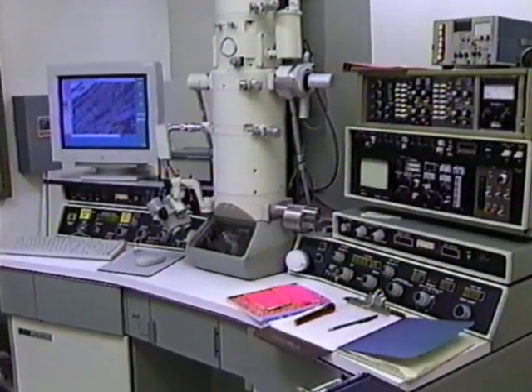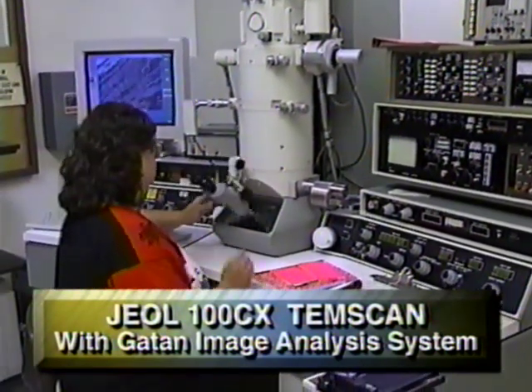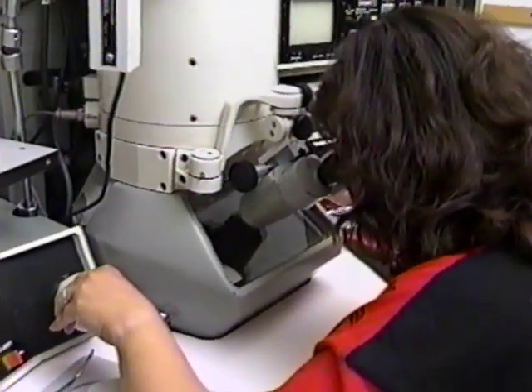Well, it's so impressive, the varied applications, like you say, looking at heart tissue, or looking at mustard, or looking at oil in a refinery. It's remarkable to see what the varied uses of this equipment are. Yes, one can look at almost anything, and in most of the traditional microscopes the samples have to be dried, except the environmental microscope where the samples can actually be wet. This particular microscope was donated partially by Chevron, partially by JEOL, which is a microscope manufacturer.